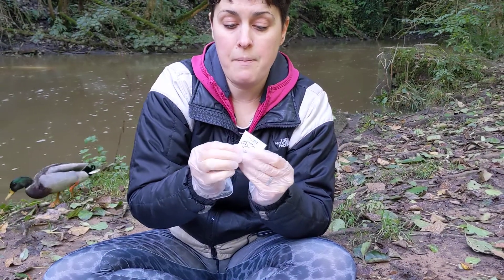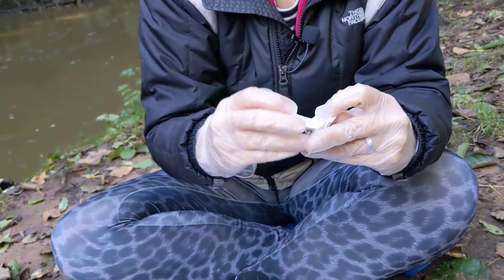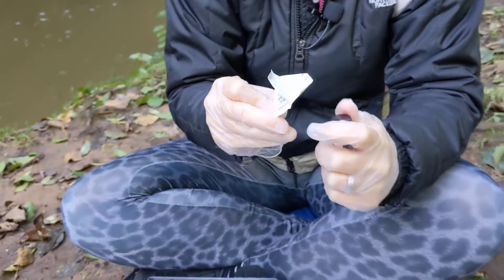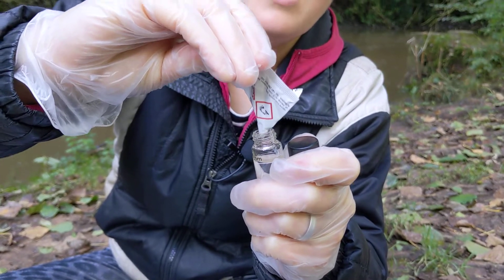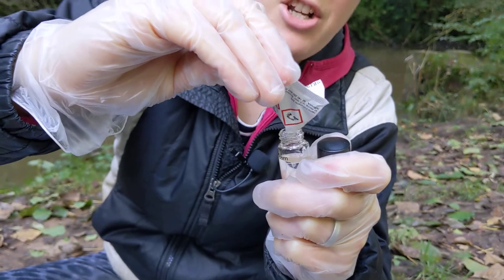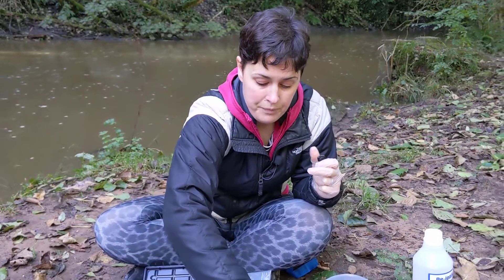When you've cut open the packet, open it out to make a sort of spout. Inside you can see the white powder — that's our reagent. Taking extra care, take the lid off your sample and pour the powder into your sample, trying to get as much as possible out of the packet. If you've got a little spatula, you might want to scrape it in, but reserve that for this purpose. Then get the lid back on as quickly as possible. Put your powder packet somewhere safe to stop it blowing away, then shake for two minutes to dissolve the sample.